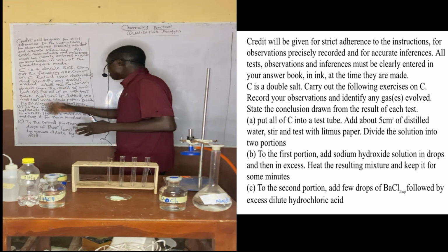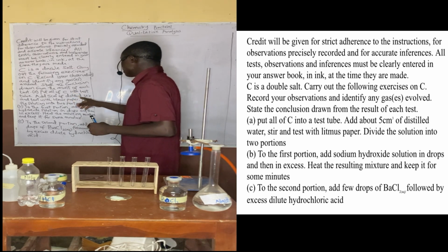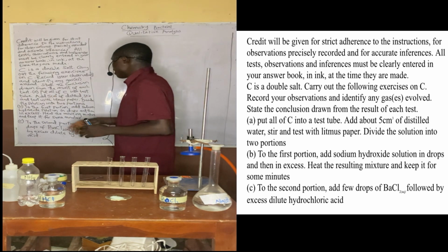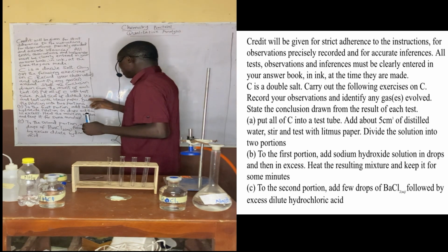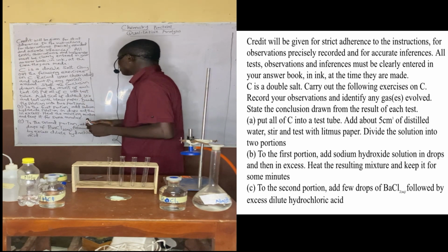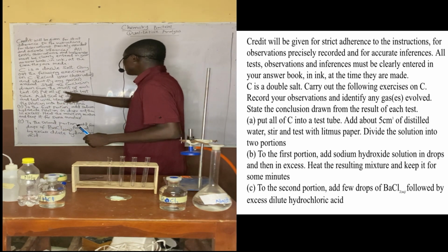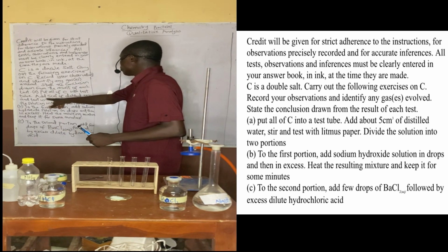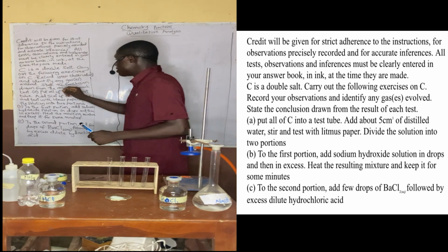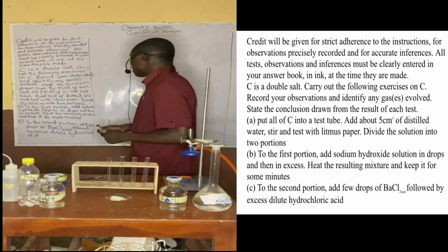Now, test A says to put all of C into the test tube, add 5 centimeter cube of distilled water, and test with litmus paper. So the first instruction is that we should add all of C into the test tube and then add 5 centimeter cube of distilled water, stir, and test with litmus paper.